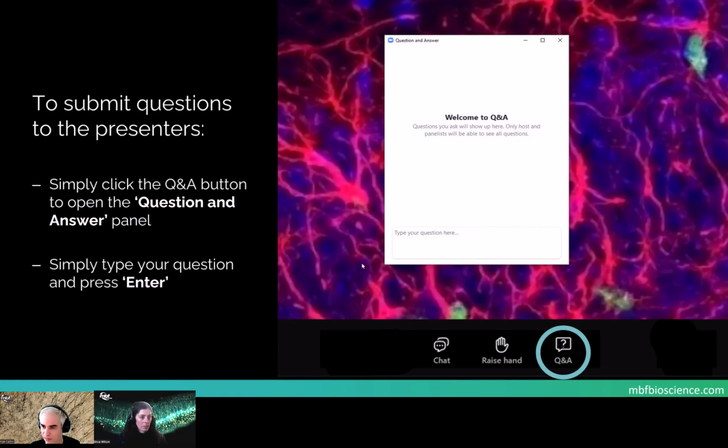There are a few questions about how long. Yeah. So we have found that your computer is an important factor in how long it takes. On our website, we do have some recommended specs for the computer. But for example, the section that I had, with about 10 sites, on some of the faster computers that we have, takes anywhere from 5 to 9 minutes to run. With less processing power, it would take longer. But the nice part is this is something that can run overnight. While you are home enjoying your personal time, the computer can still be working.